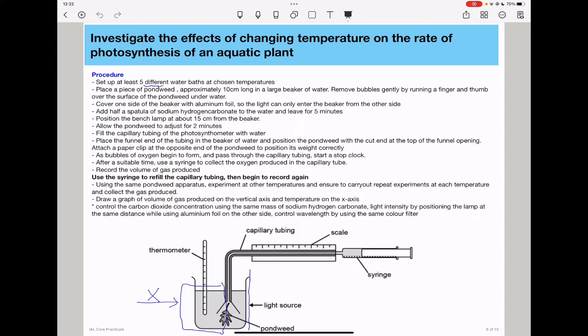Add half a spatula of sodium hydrogen carbonate to the water and leave for five minutes. The sodium hydrogen carbonate is going to provide carbon dioxide required for this experiment. Then position the bench lamp at about 15 centimeters from the beaker. Remember that the bench lamp provides the light source.